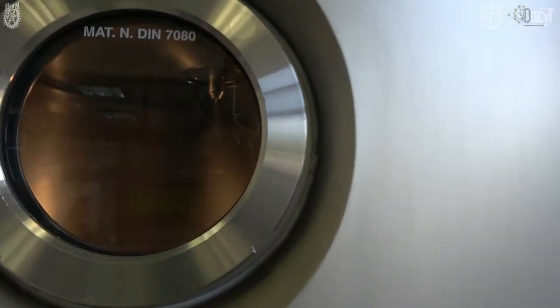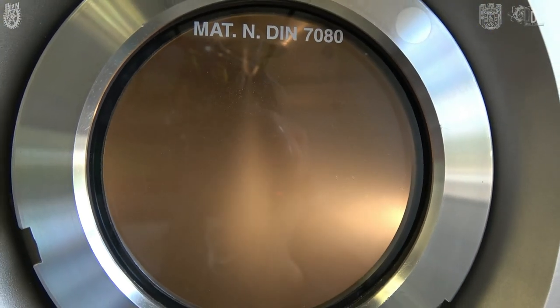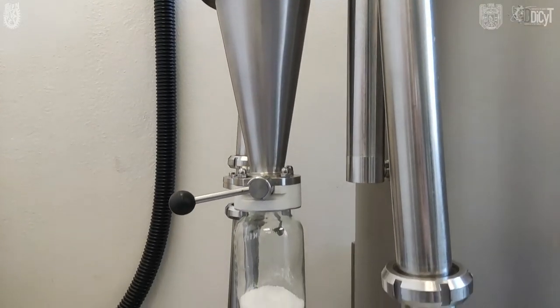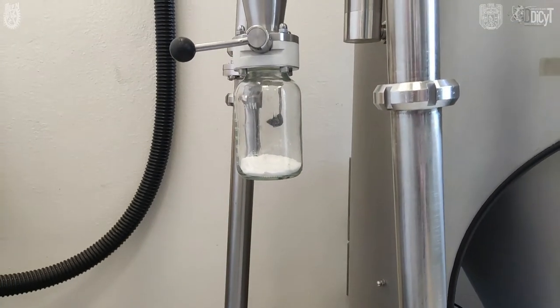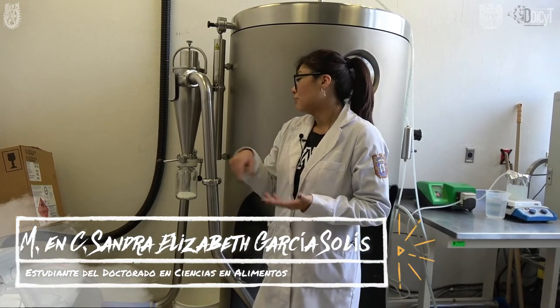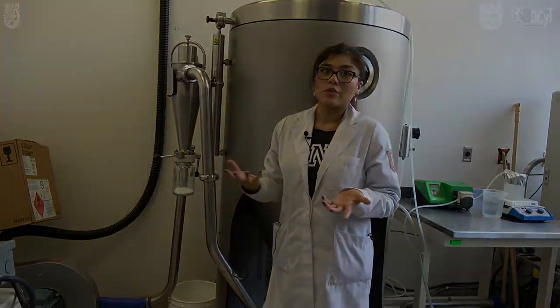Aquí en la cámara, la corriente del aire va a ir jalando el polvo hasta obtenerlo en nuestro vaso de cristal. Y ya aquí tenemos lo que sería la leche en polvo, la cual es utilizada para volverla a rehidratar o a disolver en otro medio líquido.